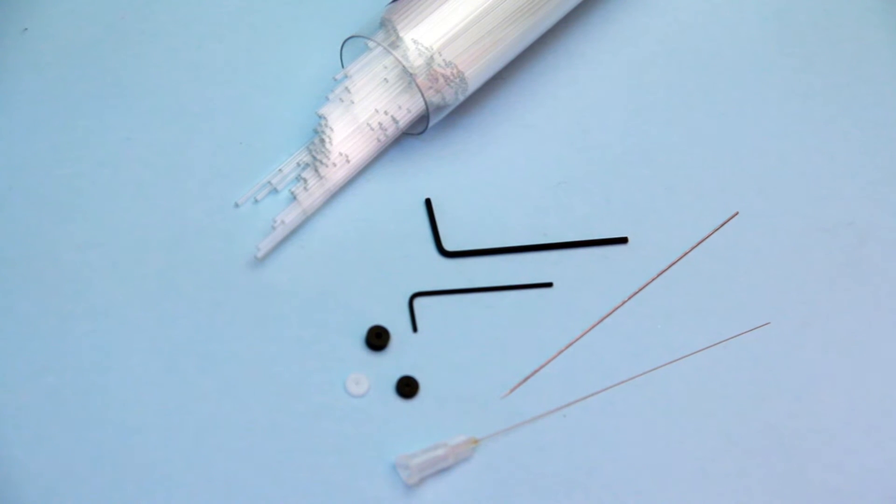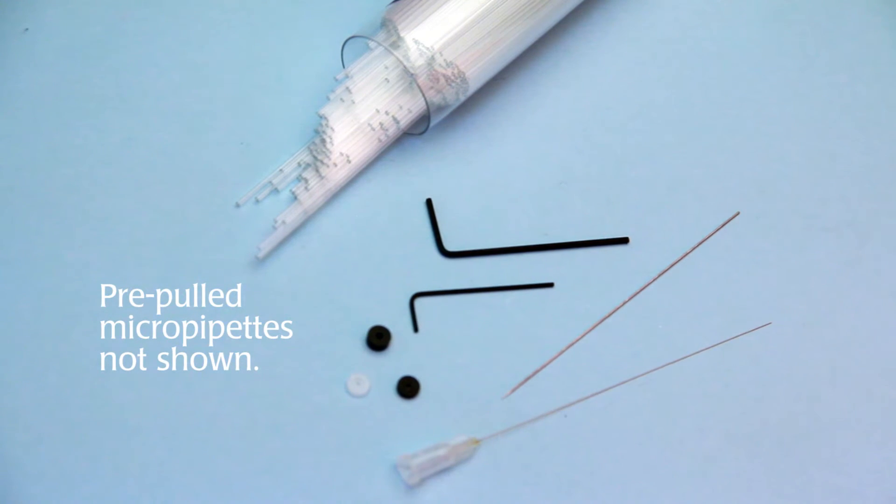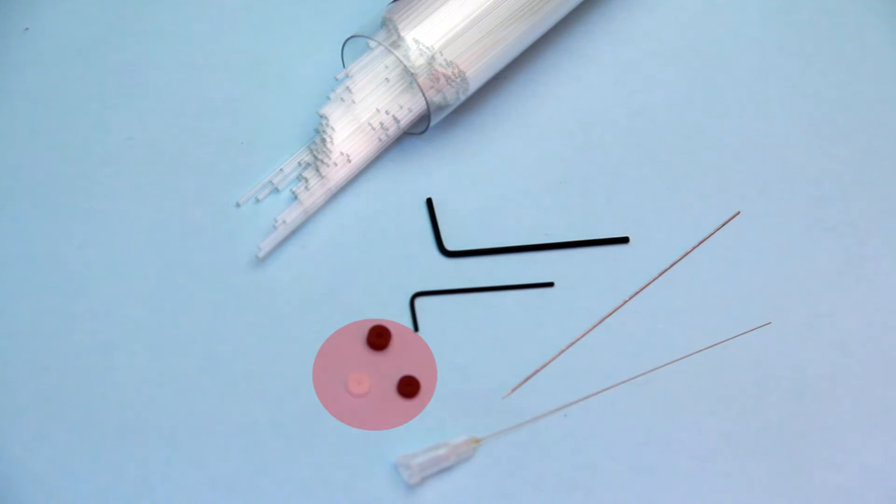Included with the instrument is a vial of 300 glass capillaries, a microfill backfilling needle, two sample microtip pre-pulled micropipettes, and replacement o-rings.